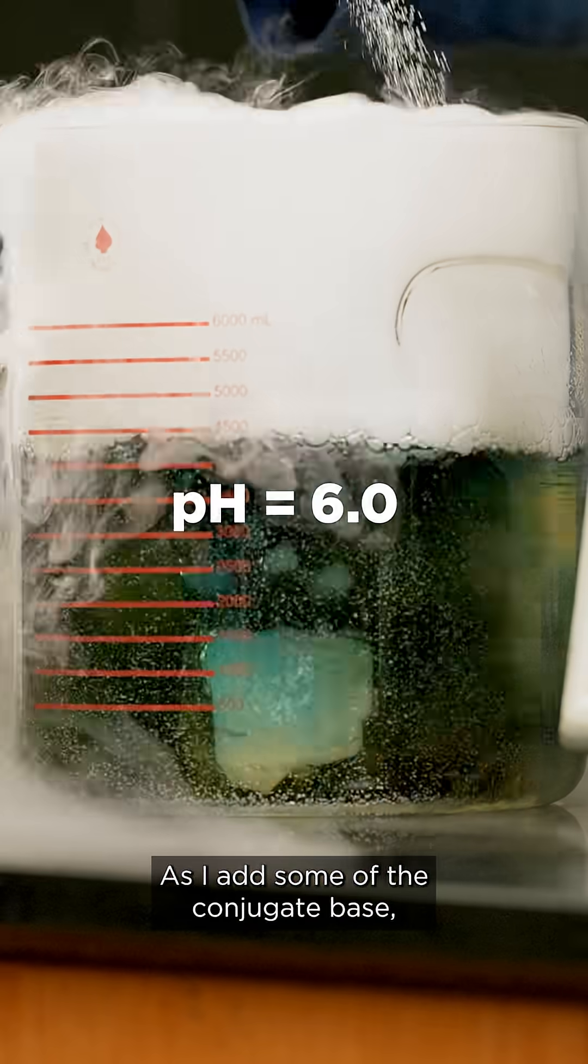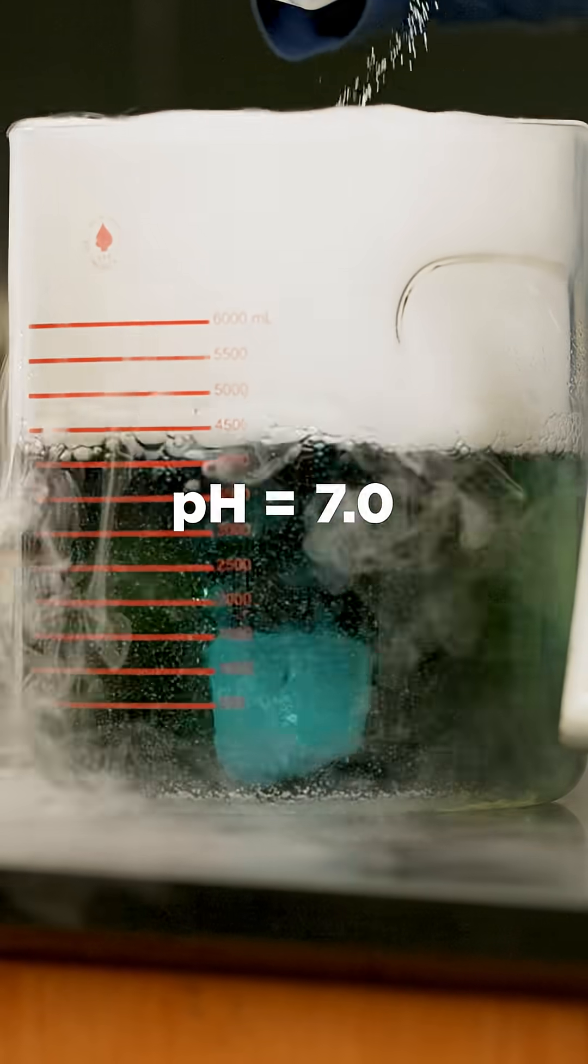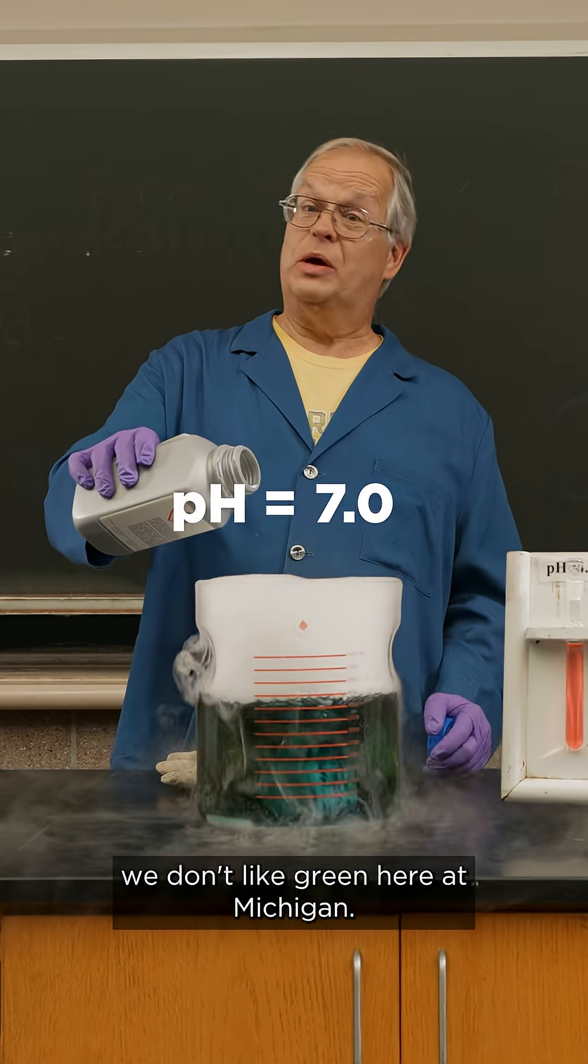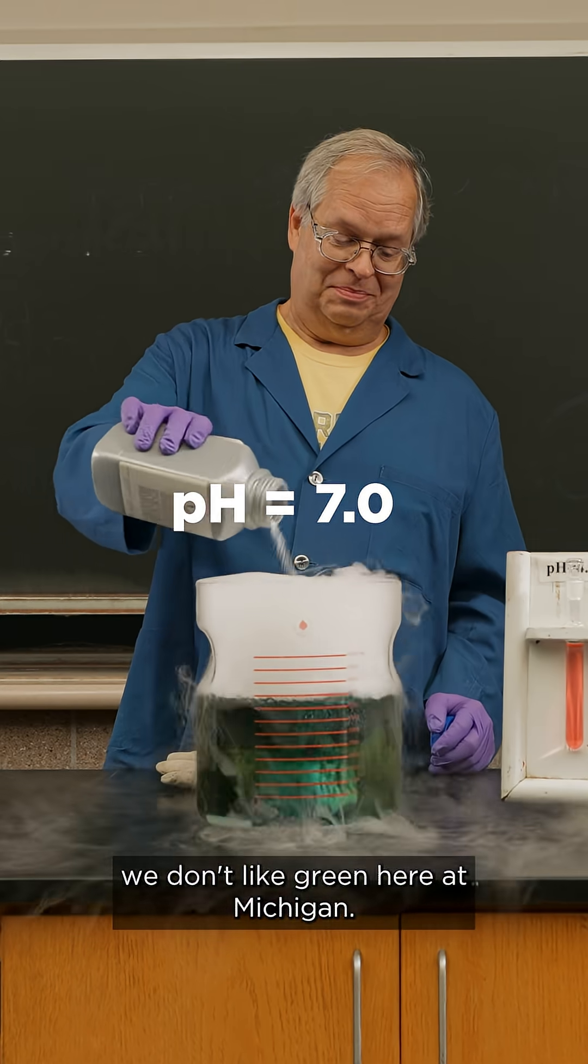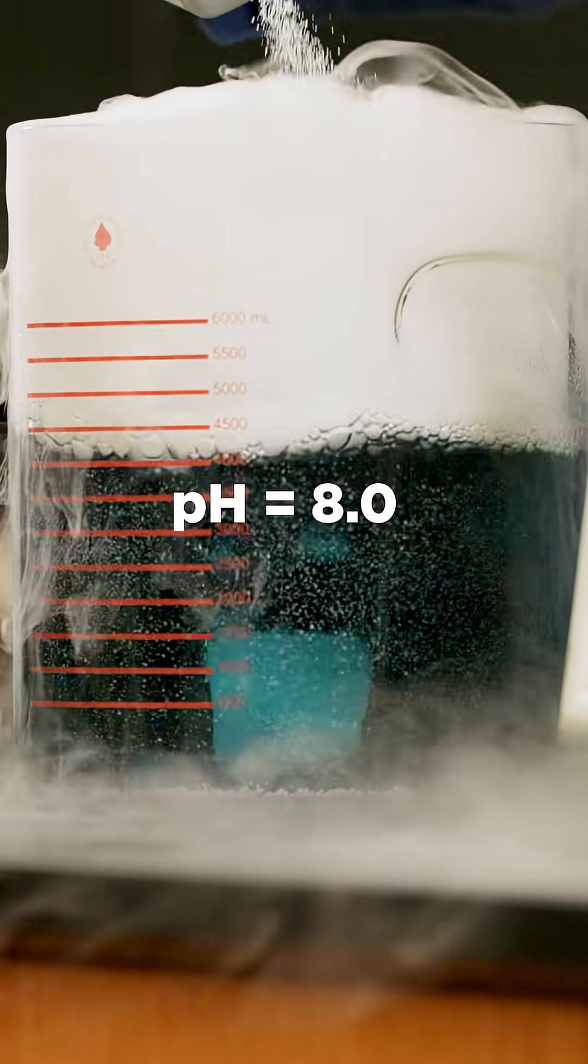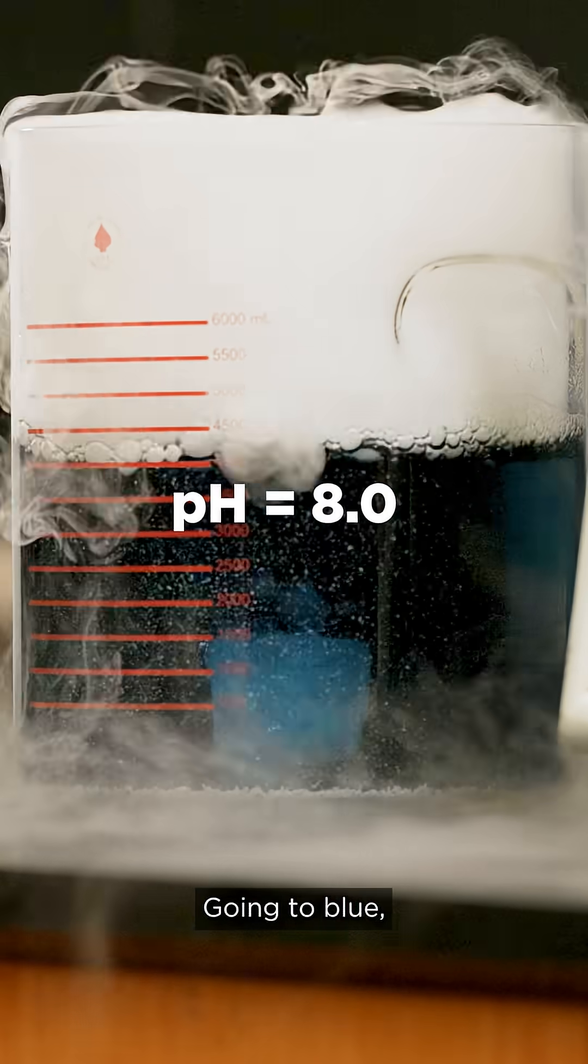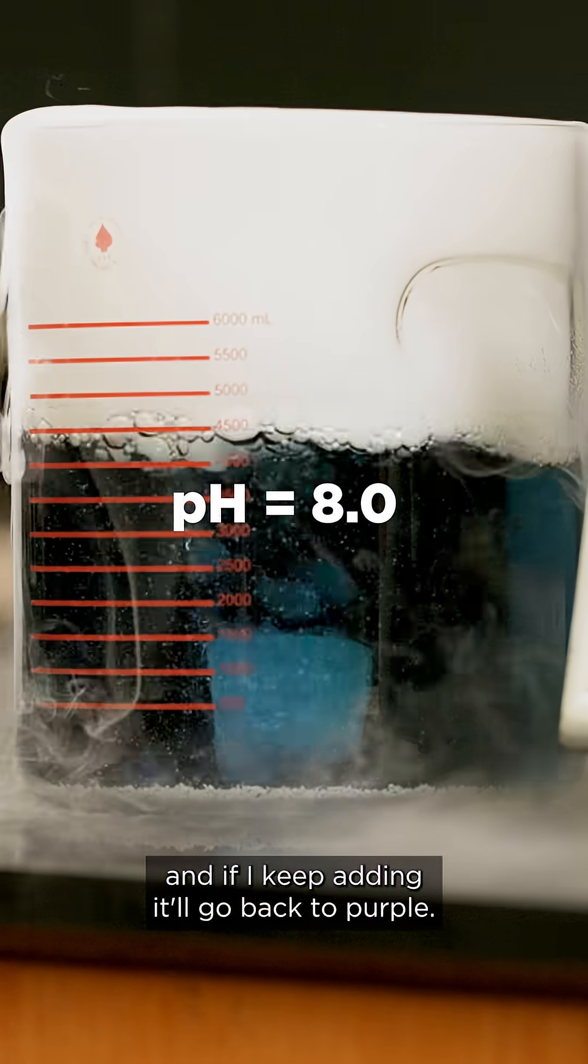As I add some of the conjugate base, we're green. We don't like green here at Michigan. Going to blue. And if I keep adding, it'll go back to purple.